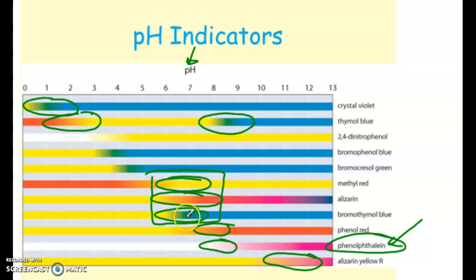Same thing with bromothymol blue. The yellow to blue, it's a green color in between, but this green is very, very light. It almost looks like a blue-green. So again, students have a hard time: well, is it blue or is it blue-green? Same deal with all of these; these three here are all like orangey red. Phenolphthalein is the best one to visually see because it is colorless and then pink.